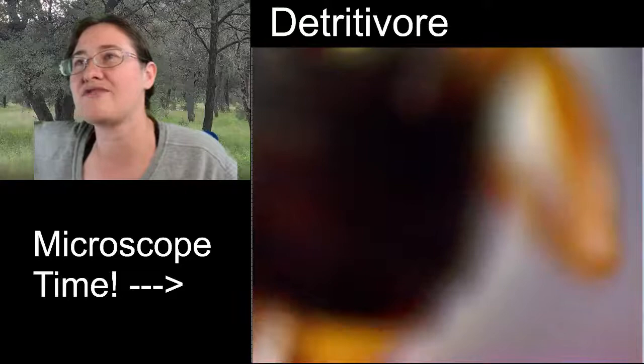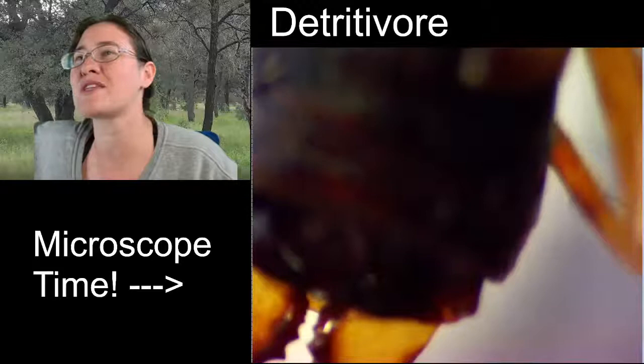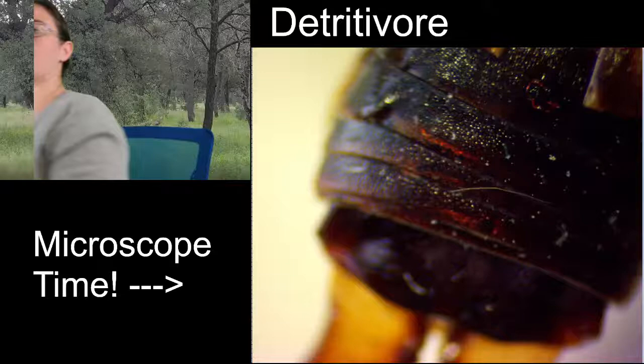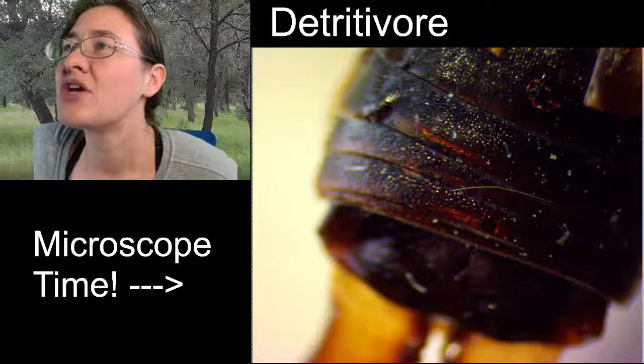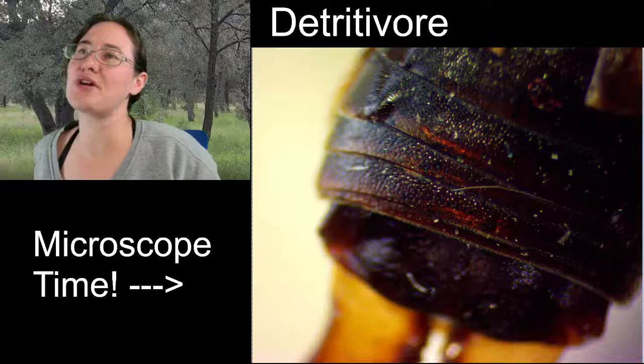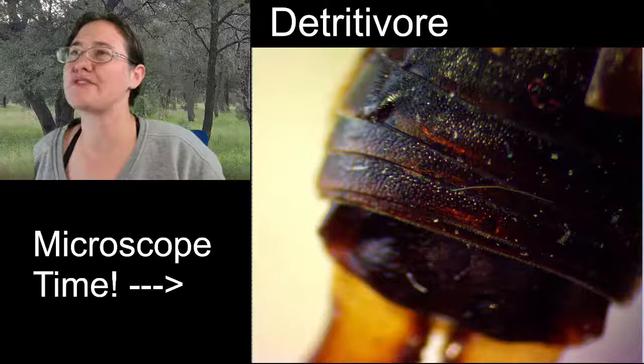Let's see. Now that we moved the specimen for different lighting, I'm curious if those are going to come out a little bit better. You could argue that that's punctate. But I think that I would more call it textured. Maybe even leathery or rough textured.